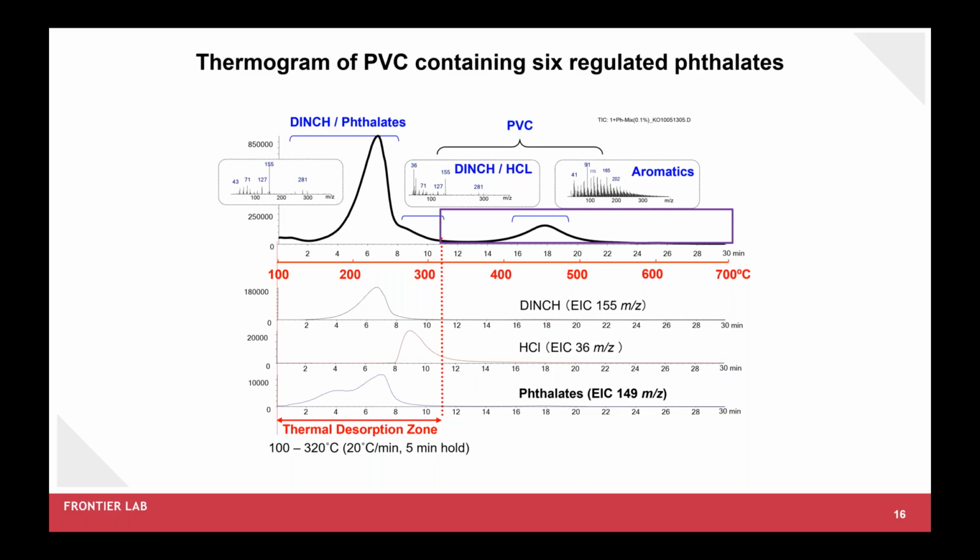And this means that the polymer remains in the sample cup and is not introduced into the GC inlet, column, or MS. And because the bulk of the sample, which in this case is the polymer fraction, remains in the cup, more sample can also be placed in the sample cup to improve the signal to noise of the target compounds.